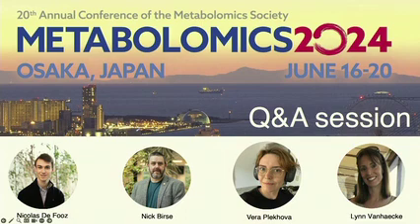I'm itching to answer that question. I believe it's due to space charge, but the people from Waters I talk to refuse to acknowledge that TOF mass spectrometers can have a space charge effect, because your space is much larger, so you don't get charged.